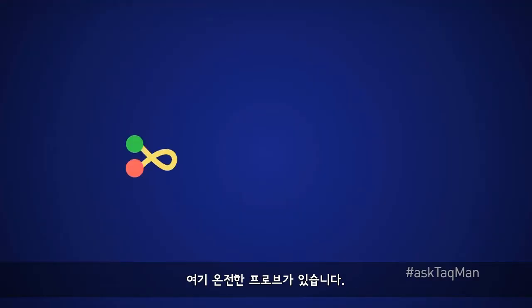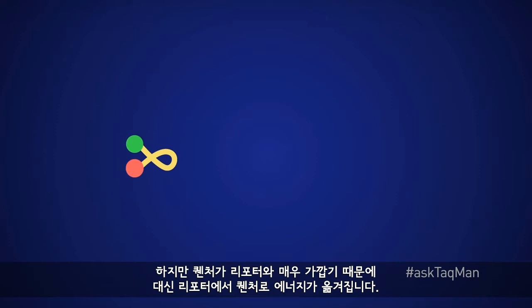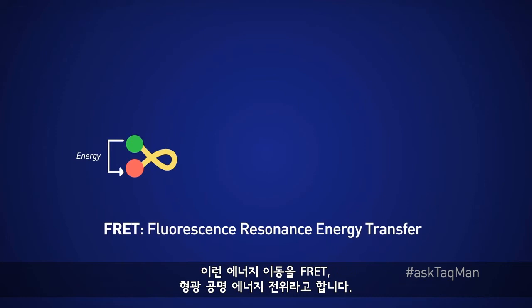Here, we're looking at an intact probe, with the reporter in green and the quencher in red. Normally, when we zap the probe with light, we expect the reporter to get excited and fluoresce. But because the quencher is in close proximity to the reporter, instead what happens is the energy gets transferred from reporter to quencher. This phenomenon is known as FRET, or Fluorescent Resonance Energy Transfer.